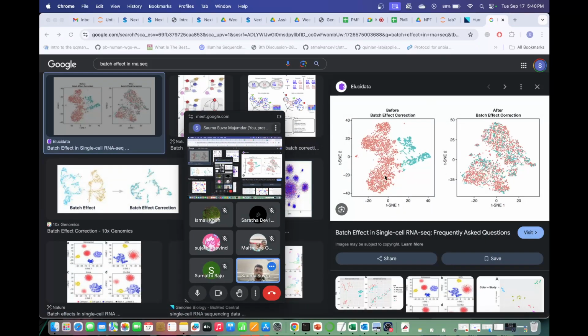Say for example, forget about t-SNE for now. You are imagining the samples in space, with the coordinates being the gene expression profiles, for each gene. Now you take a healthy set of samples and a disease set of samples, sequence them separately, form the RNA-seq dataset, and try to find differential expression or whatever analysis you're trying to do.